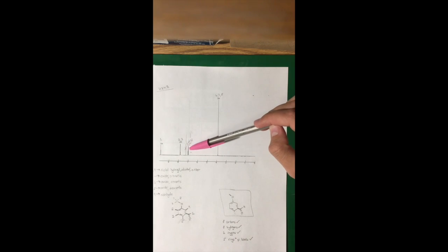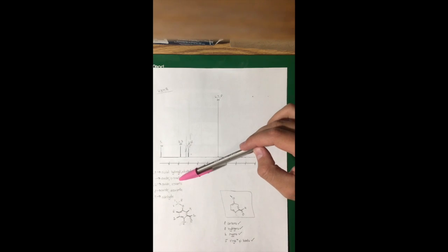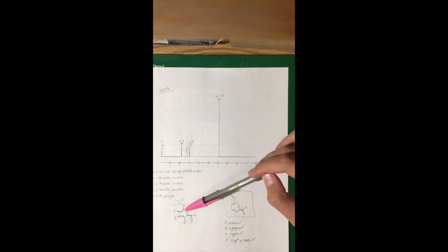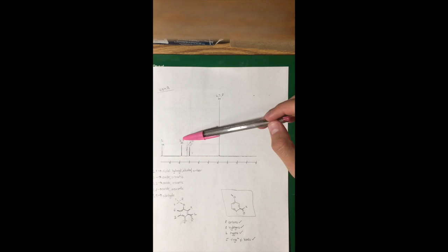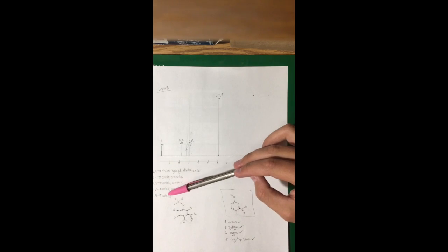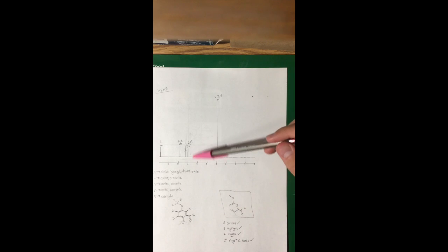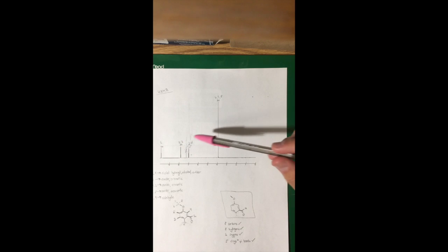These next 3, at 7, 7.2, and 7.8, all came to be an aromatic, which we have here at 2, 3, 4, and 5, all off the aromatic. And then this last one here, correlated to 1, at the 9.9 position roughly, was found to be an aldehyde, which correlated right here next to the aldehyde. So that is the positioning of our hydrogens within this molecule.